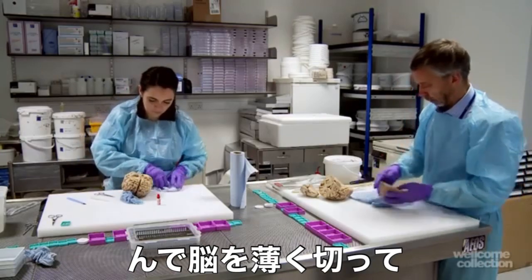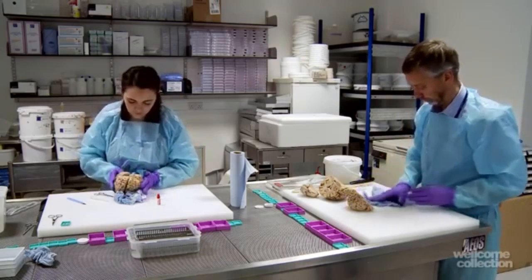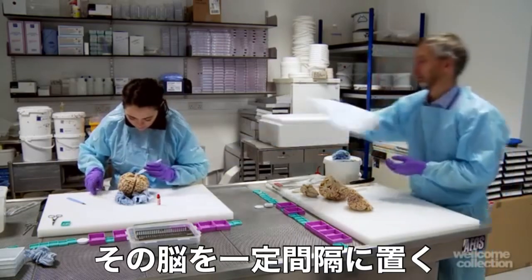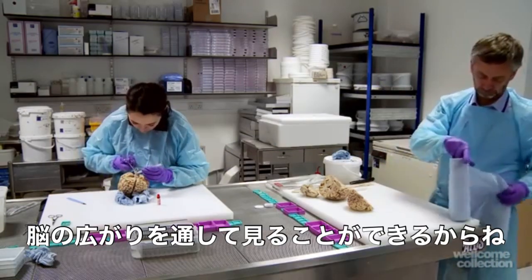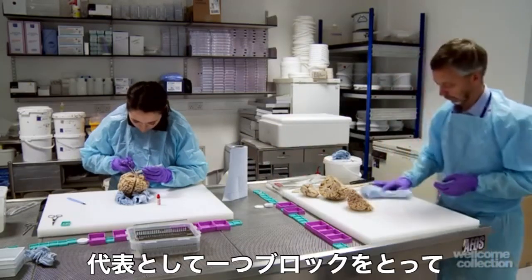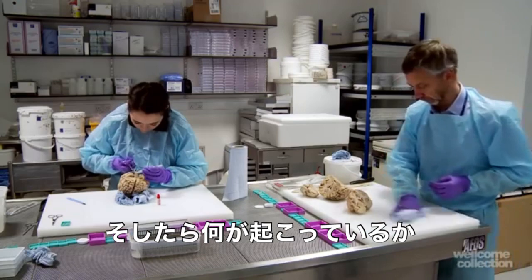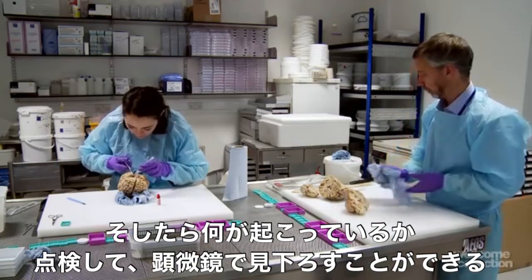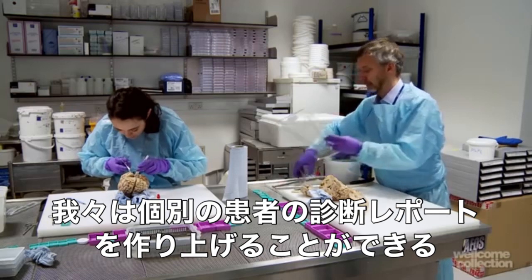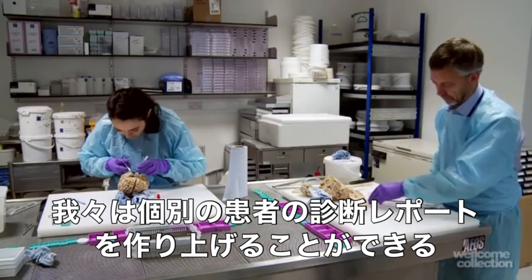We then slice the brain up into what we call coronal sections, and space those out so that we can have a look through the whole extent of the brain to look for any pathology. We then take some representative blocks so that we can follow up and look down the microscope at what's going on.